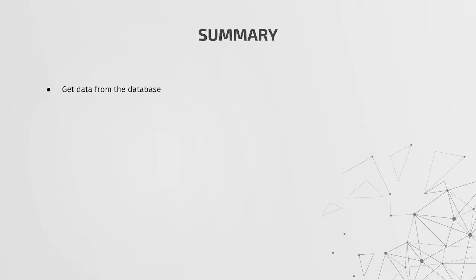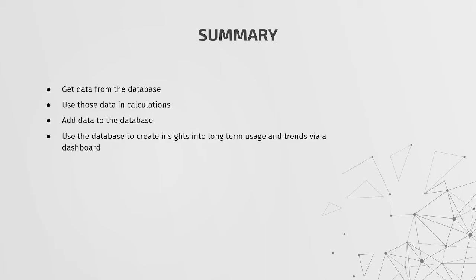So to summarize, we've looked at how to get data from the database and how to use those data in particular calculations, whether it's creating a dashboard or calculating other values and putting them back into the database. And we looked at how to append columns to the database. And ideally, you want to use this database to create insights into the long-term usage and trends in your database. And a good way to do that is via a dashboard to summarize your data.